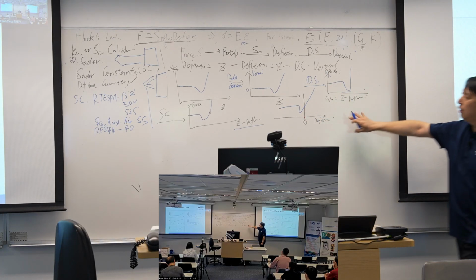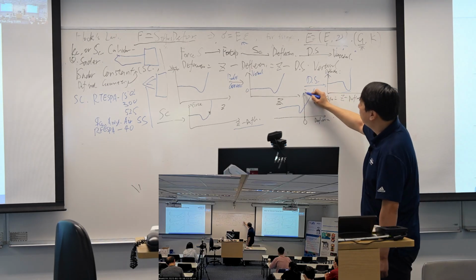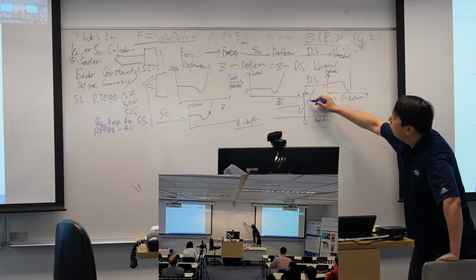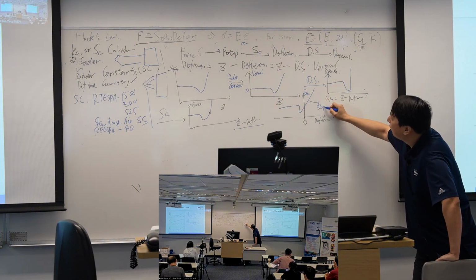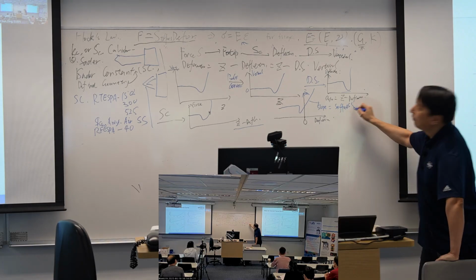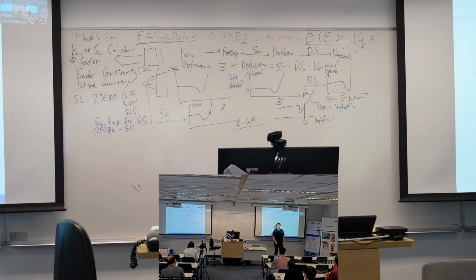So finally, this is our curve, the force against the deformation. And then from the slope, this is our stiffness. That's the scientific way to process this force curve.